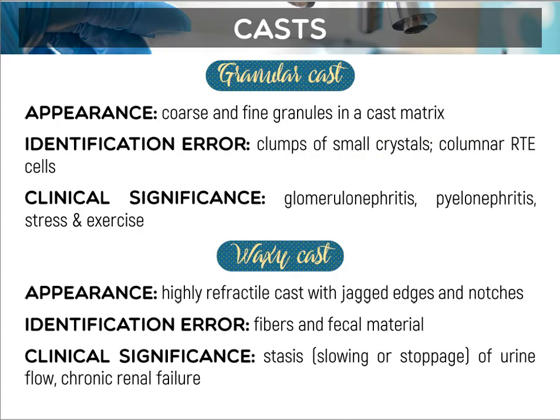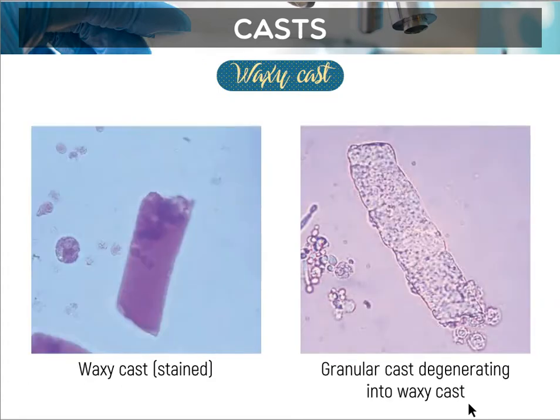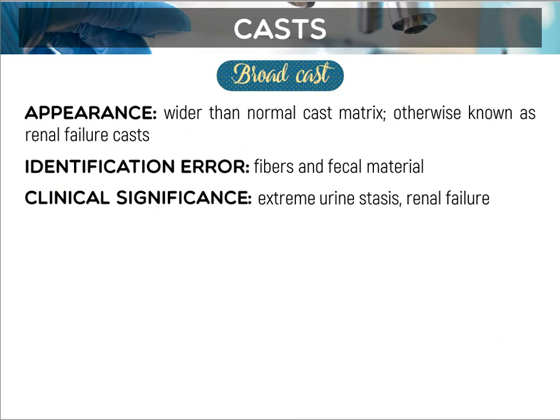Okay? So, next up, we have your waxy cast. Waxy casts are highly refractile casts with jagged ends and notches. Its clinical significance is stasis or slowing of urine flow, chronic renal failure. And then, ang pinaka-grabe kay finely granular, coarse granular, waxy.